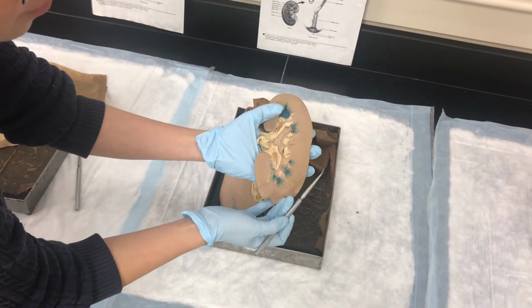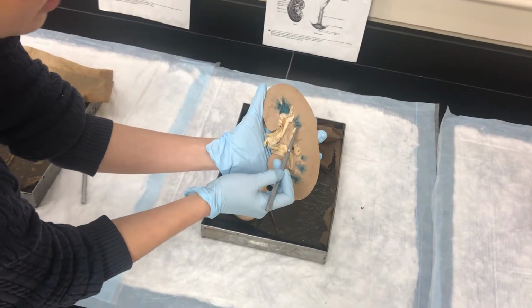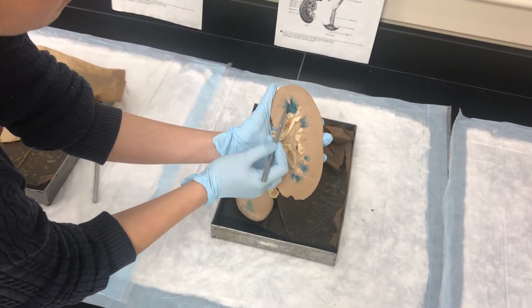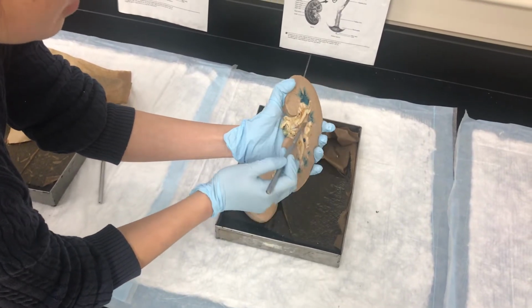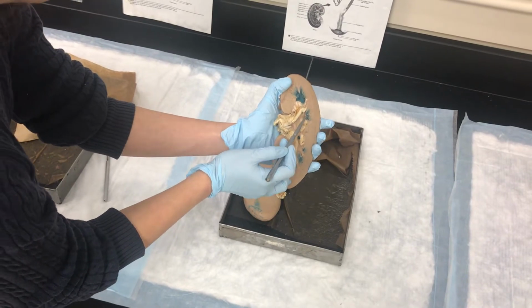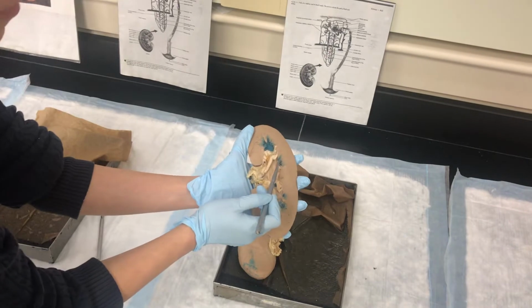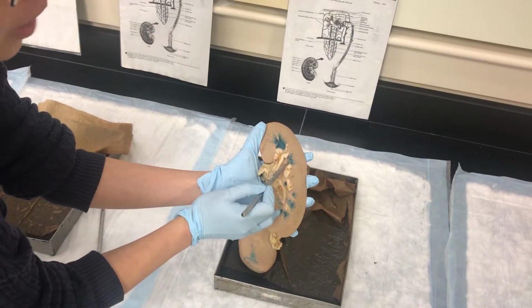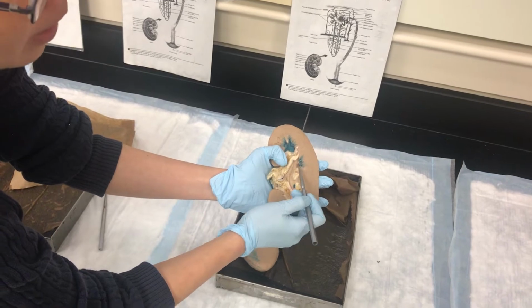So it's kind of nice because you have the blue dye showing you all the striations of the medulla, but here's pyramid, pyramid, pyramid, pyramid, pyramid. And this one is also cut in a way where you can see the tip of the pyramid right here. And the pyramid is made up of a whole bunch of collecting ducts that all funnel into the tip like a shower head. And so at the shower head, that's where all of the drops of urine come in.